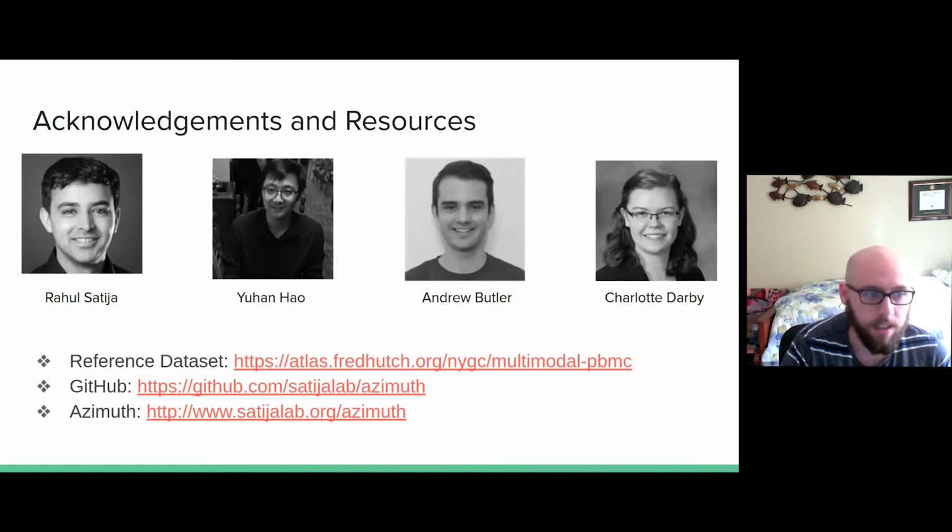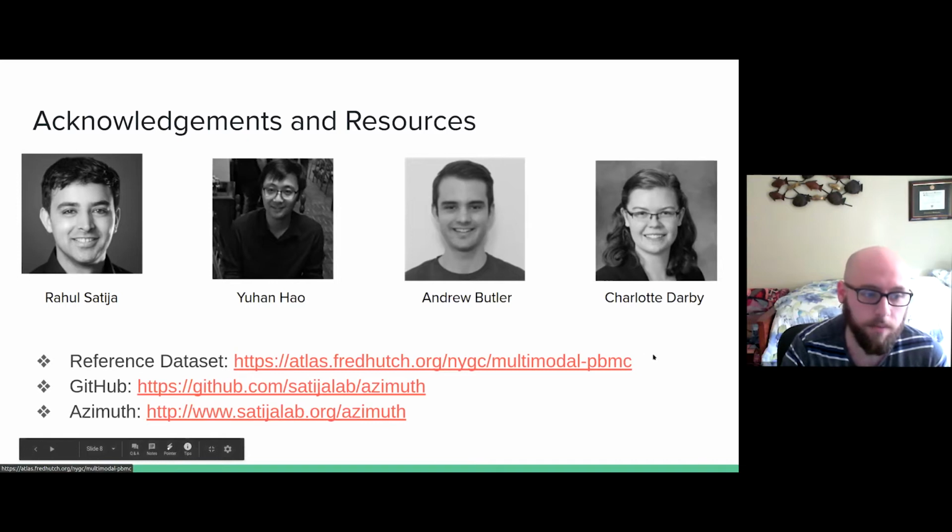This work was done in collaboration with several members of the lab. Yuhan, Andrew, and Charlotte in particular helped a lot with building the mapping algorithm and getting the app built and deployed. If you'd like to play around with our reference data set, the full reference is hosted at the Fred Hutch. You can view the source code for Azimuth on GitHub. All of it's publicly available.